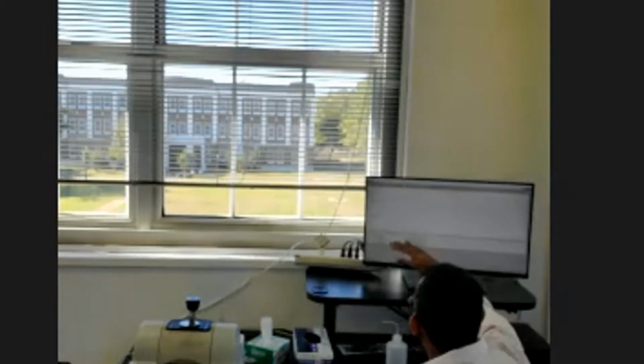Yeah, it gave me something. But you see, the match over there was so high. Remember, the match was about 70 something. It picked up the peak for acetylsalicylic acid and aspirin in there, but it's not as clean as they say with the other. So you see, it gave you 3-phenyl toluene in there, benzyl chloroacetate, triphenylphosphine. Oh my goodness, there's a lot of crap. It's a lot.